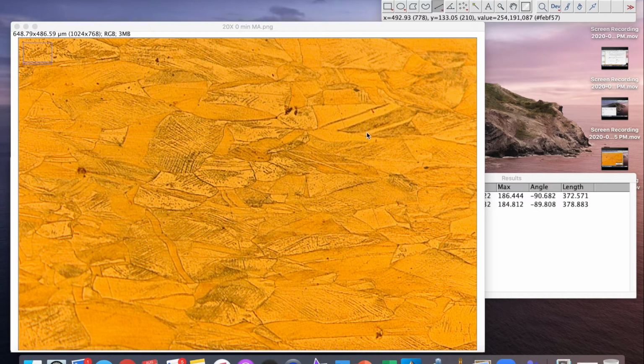All right. I want to show you a couple of tips and tricks that might help you with this counting procedure, because I showed you one, but as you can imagine, you and your group are going to be doing a lot of these. So consider these couple of tips. Maybe they help things out. I can draw a line as I showed you, but if I try to do anything else, it's going to erase that line. So you have to be careful not to click anything. That can be an issue.